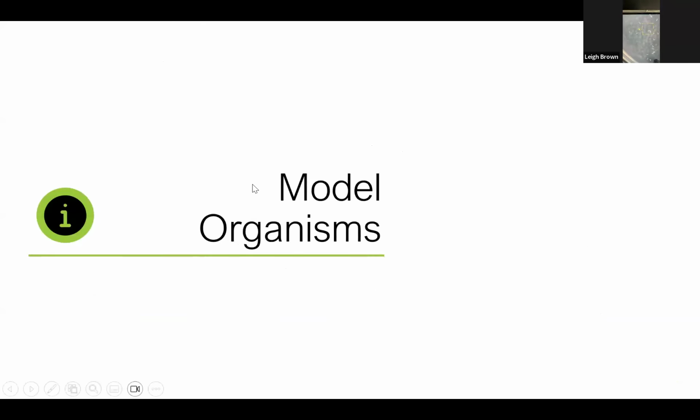So Damon, I don't want to give away the punchline here, but I wanted to just point out that this is my wild type plate, and my salt dot is on this side. Let's see if I can get the right. It's mirrored, so I'm trying to figure out. Okay, here we go. Right, and then my buffer side, my control, is on this side.